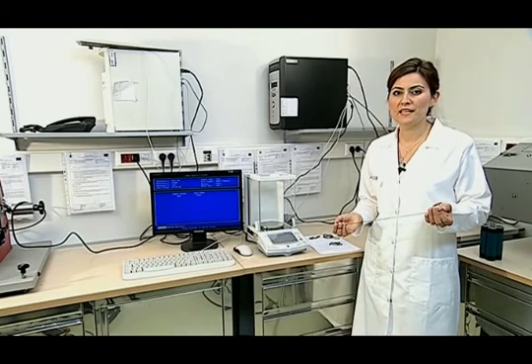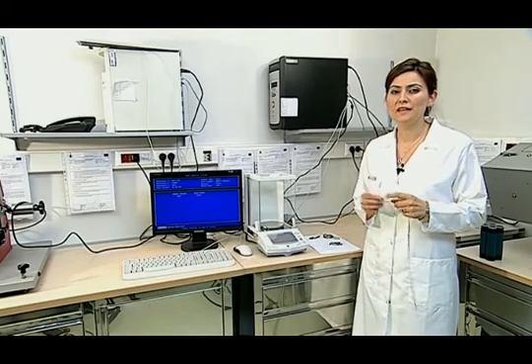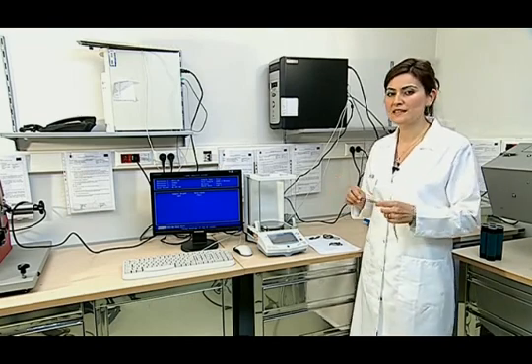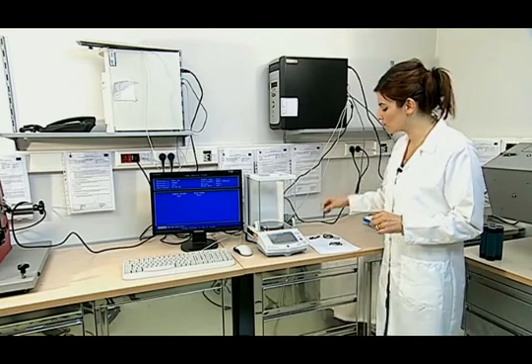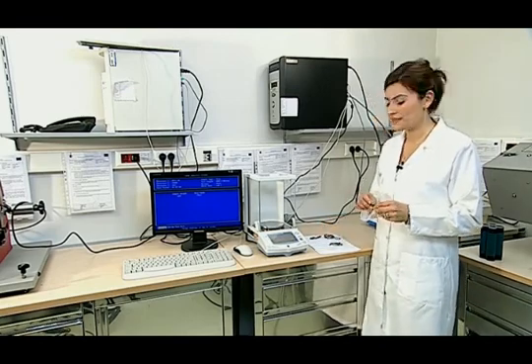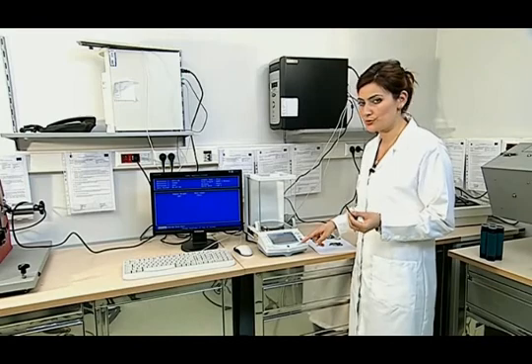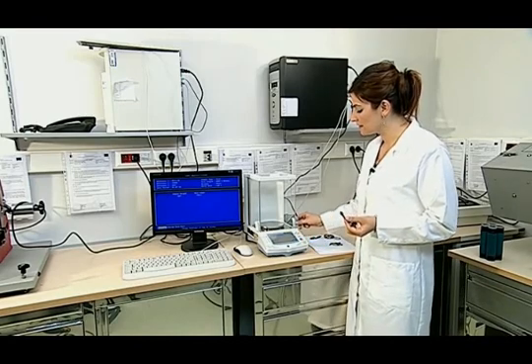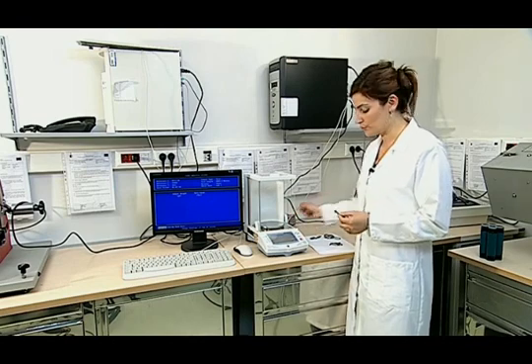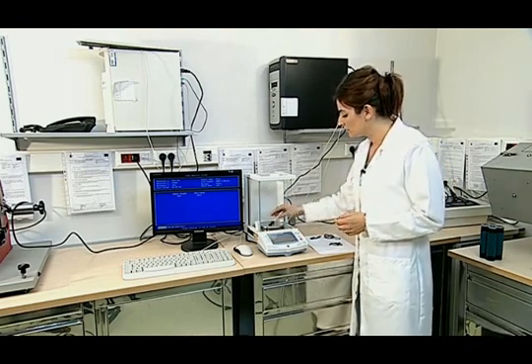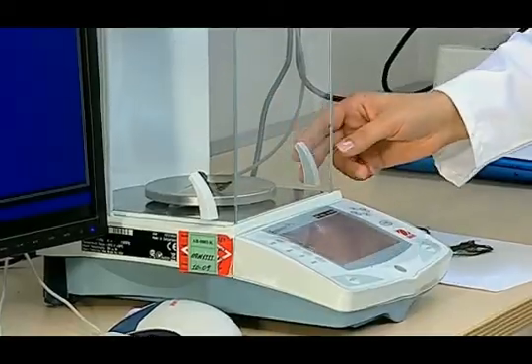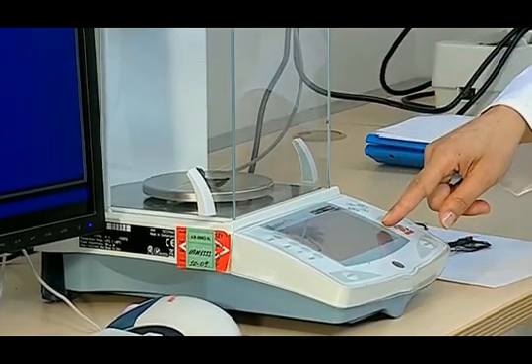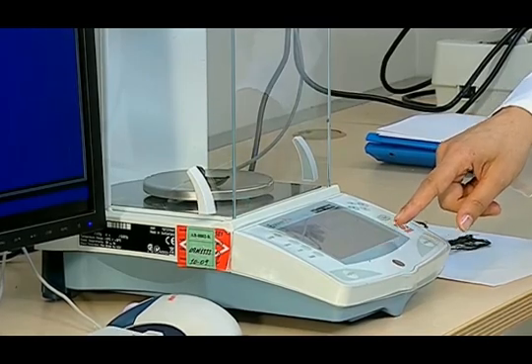We prepare groups of 10 samples from a total of 50 samples that have been taken out of the fabric. Before weighing our samples, we condition them in standard atmospheric conditions. We weigh our conditioned samples with the precise balance. Firstly, we ensure that the precise balance is at zero. On the screen, we read values for 10 samples in grams, and we record the values.